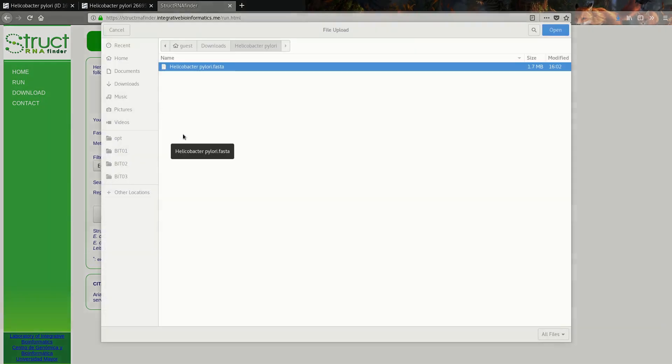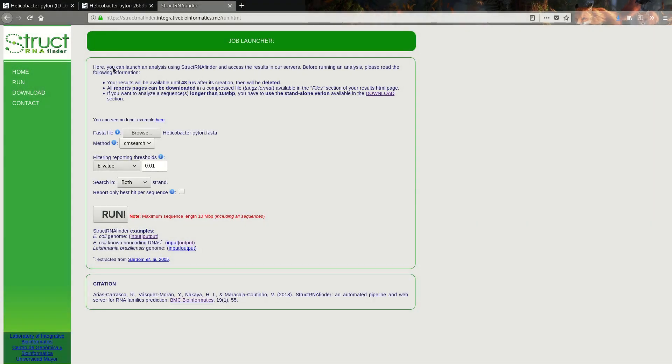Now you can see the file is loaded. You need to choose a method. The methods are not that important in our case, but the differences were made clear in the presentation. I will use CMSCAN for this one and leave the rest. Then just click run and it will start running.